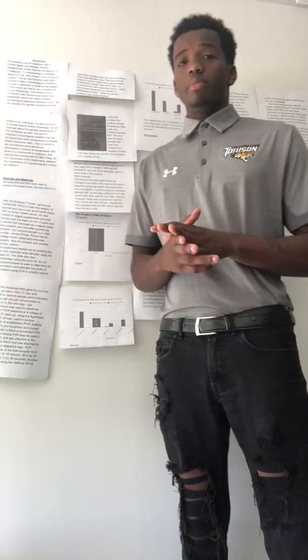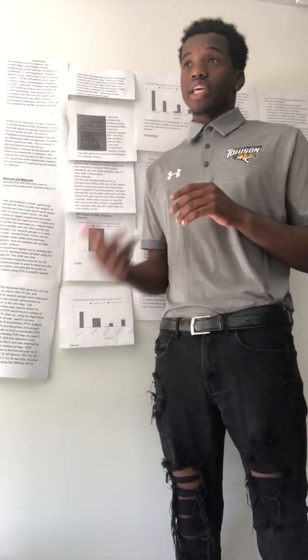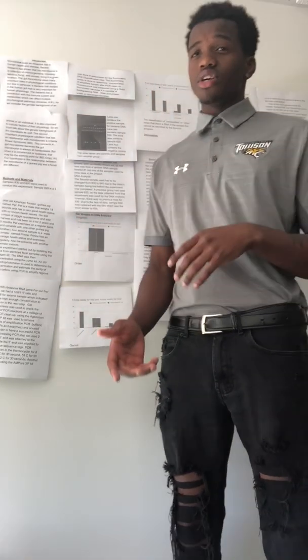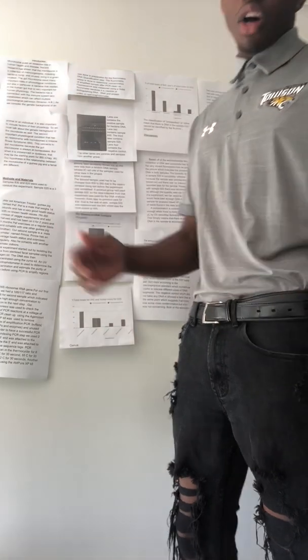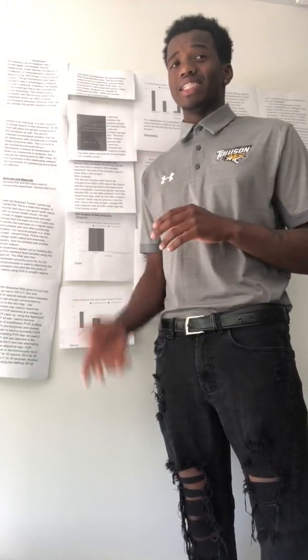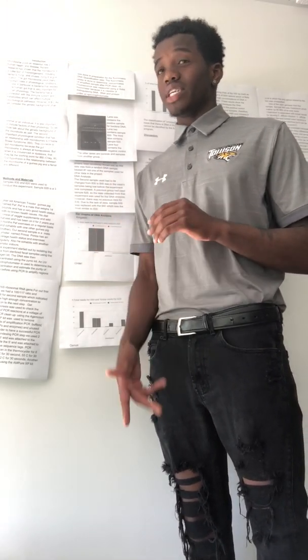Right now, I want to talk about the major steps of our experiment. We started off by isolating DNA using the Qiagen kit. Then we used the Zymo kit to concentrate DNA. Next, we used the UV spectrometer to estimate the purity and concentration of DNA before the PCR, which amplifies the bacterial 16S ribosomal RNA. The first sample ratio was 100 to 117, and the second was 100 to 5.36.